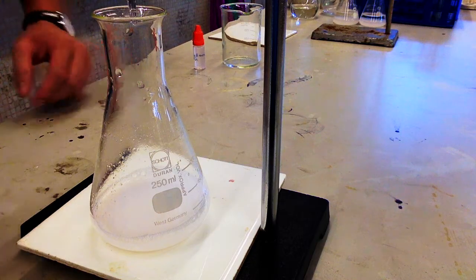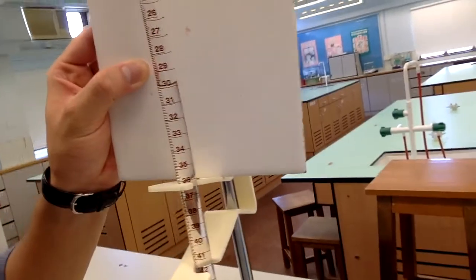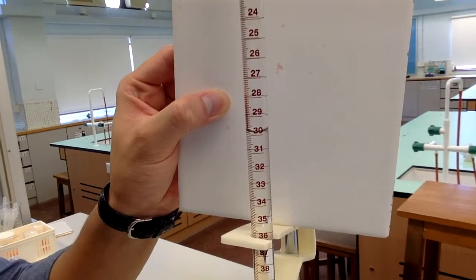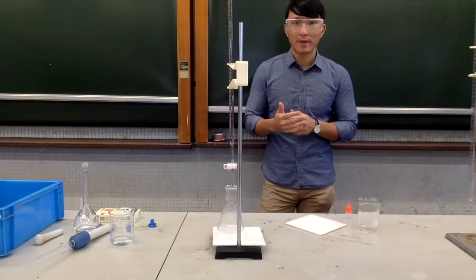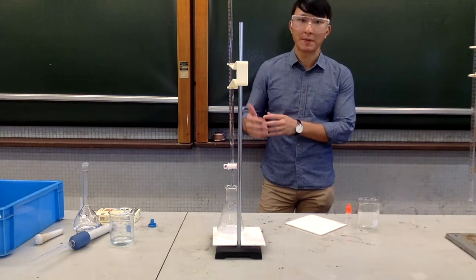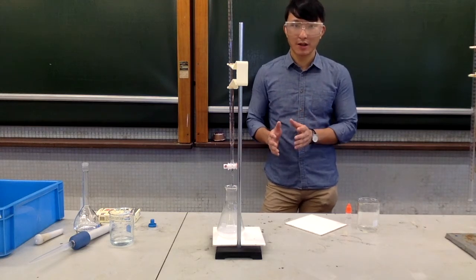Now we should record the final burette reading. This one should be 29.9. In order to make our result more reliable and precise, we should perform several more repeated trials. So this is the end of the experimental part.